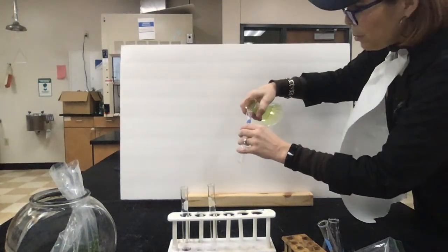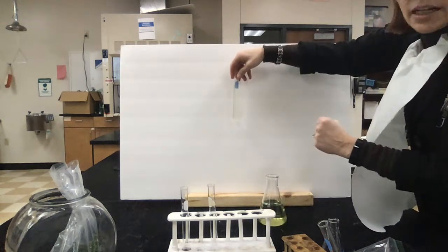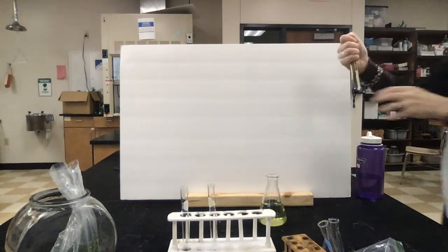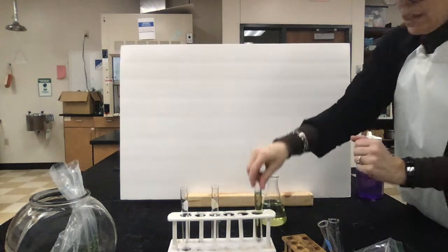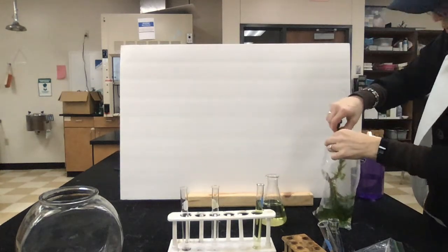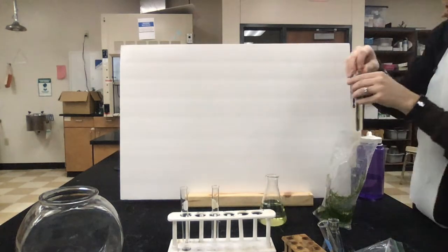So I'm going to go ahead and pour the yellow water in. And I want to make sure that I can tell that that's yellow. I might need to add a little bit more of the bromethymol blue to it, just to make sure that we can really tell the color. Can we see that that is definitely not blue, at least? And then I'm going to go ahead and add, here is my underwater plant. This is Elodea. So I'm going to add a sprig of Elodea. Here's my first sprig. I'm going to go ahead and push that down.